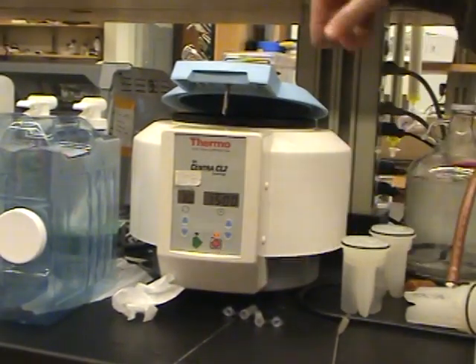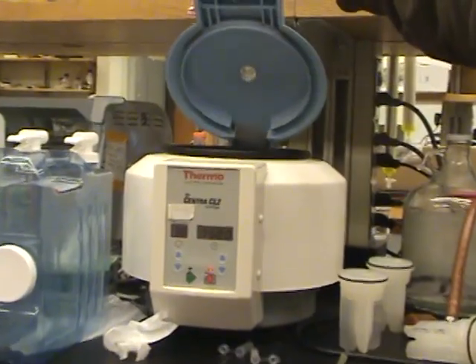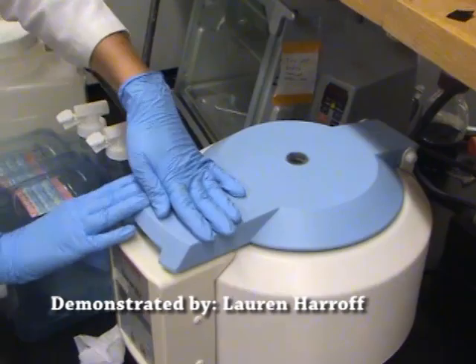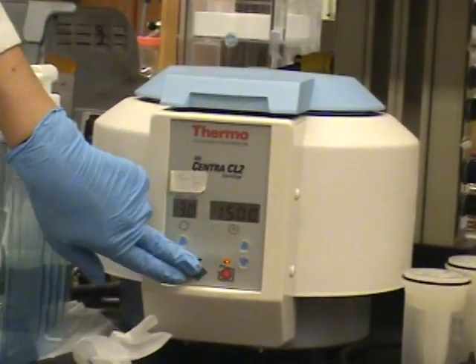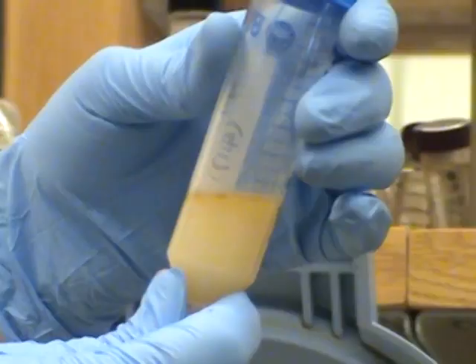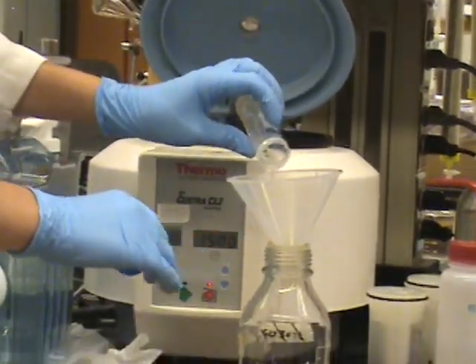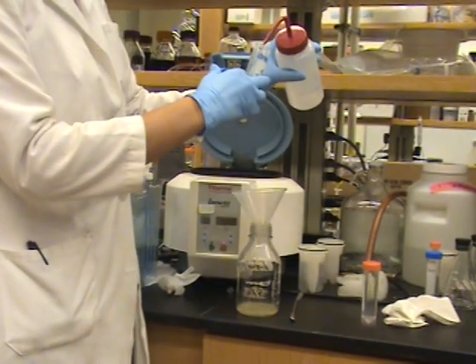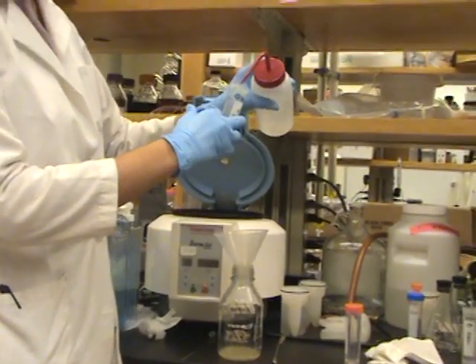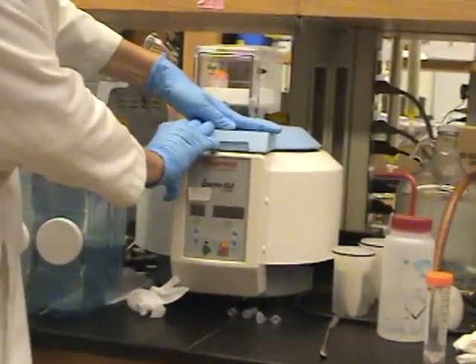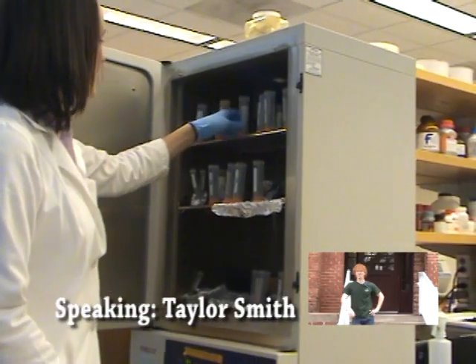Place the collection tube into the centrifuge and balance the weight. Run the machine at 3,000 RPM for 15 minutes. The centrifuge separates the algae cells or biomass from the supernatant medium. The medium is discarded. Wash the walls of the container with water and centrifuge again. The algal biomass is then dried in an oven.